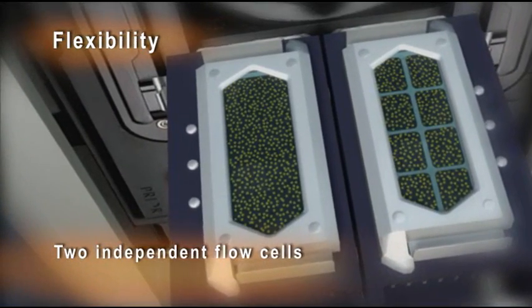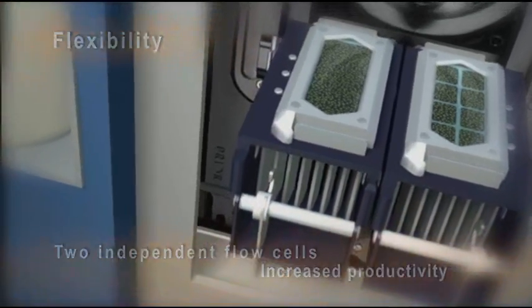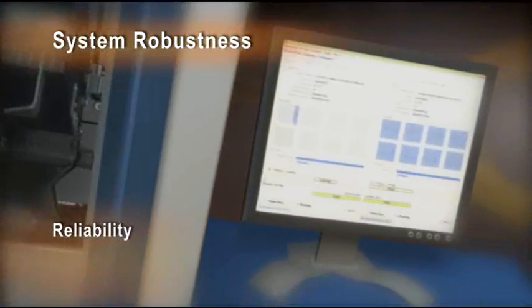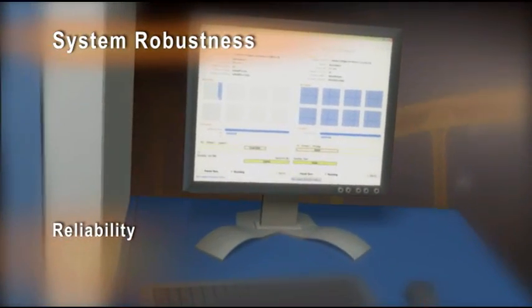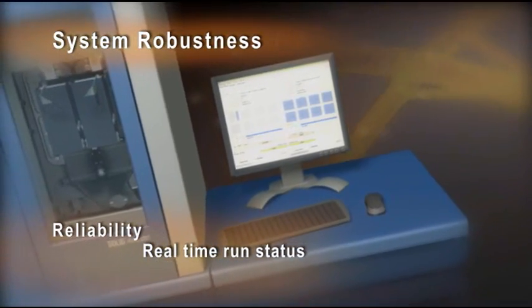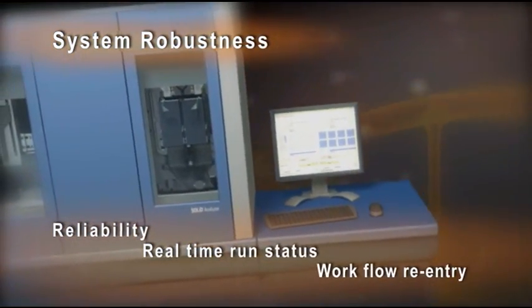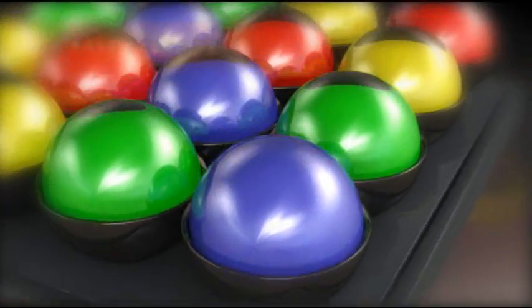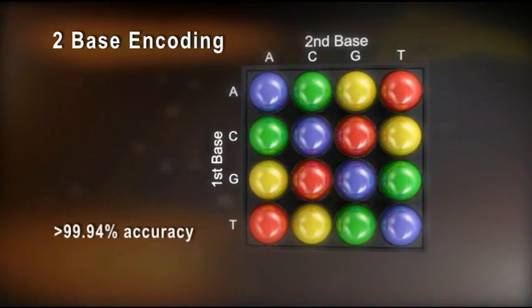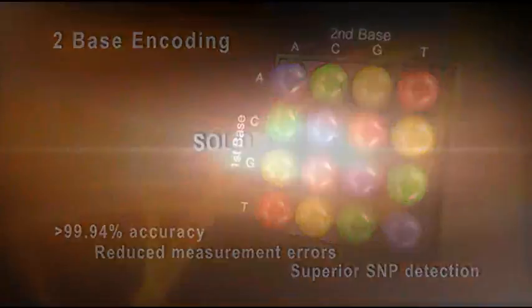With two independently controlled flow cells, the SOLiD system allows you to run two completely different experiments in a single or staggered run, increasing your research productivity. The SOLiD system delivers the robustness and reliability Applied Biosystems is known for, with features like real-time run status and the ability to re-enter the workflow at multiple points, minimizing downtime. The SOLiD system's unique two-base encoding process is designed to enhance accuracy and detect measurement errors.